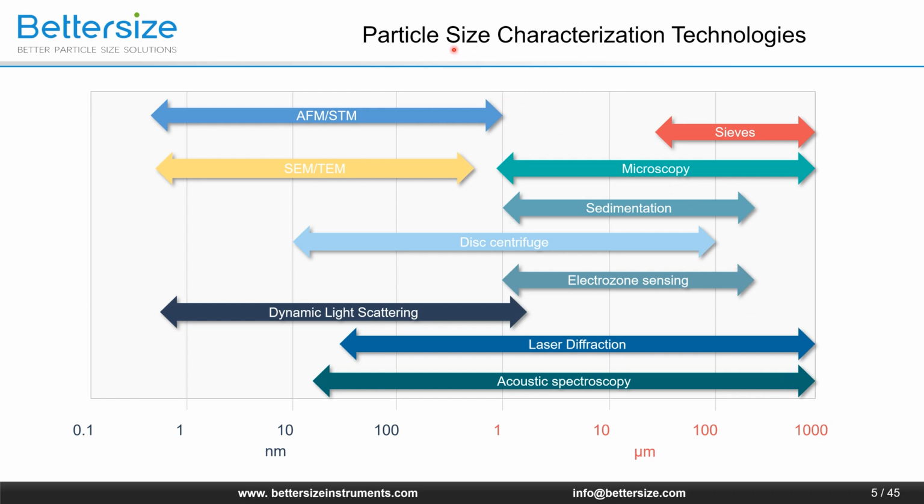What is particle size? It is a physical property to indicate how small or large a particle is. The effective control of the particle size and size distribution of materials are of great significance in many fields to improve product quality. There are many instruments and methods for particle sizing, and dynamic light scattering (DLS) is one of the most popular means for characterizing submicron and nanomaterials. DLS has advantages including fast measurement, easy operation, and good repeatability, and thereby becomes one of the principal methods for nanoparticle measurement.